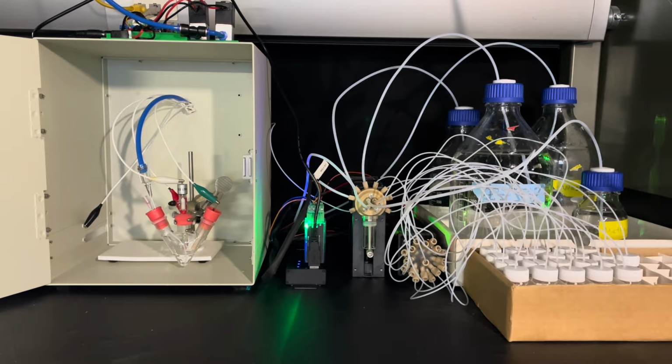So here we have our setup. We have our cell on the left, pump valve and syringe pump in the middle, and then our solutions on the right.